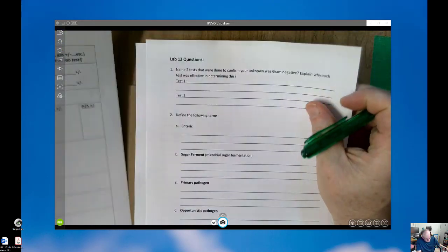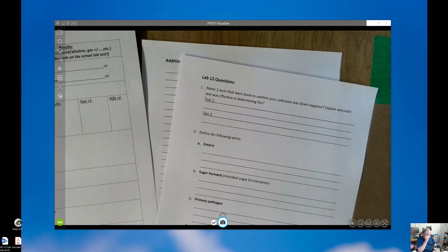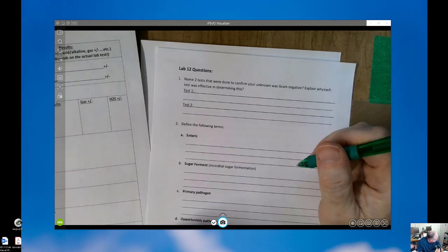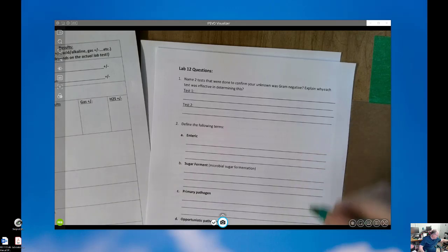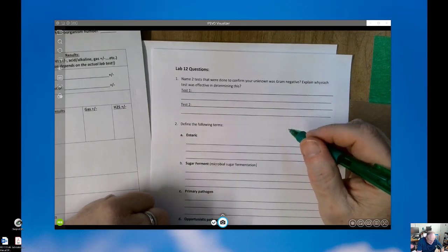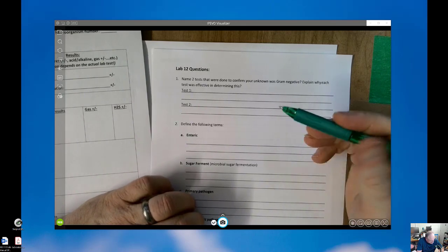So what I'd like you to do is, in your kit there you have a kit that identifies, I thought I had put this out, but I guess I didn't. Identifying the TSI. What you have are some tubes and results, and I want you to match.